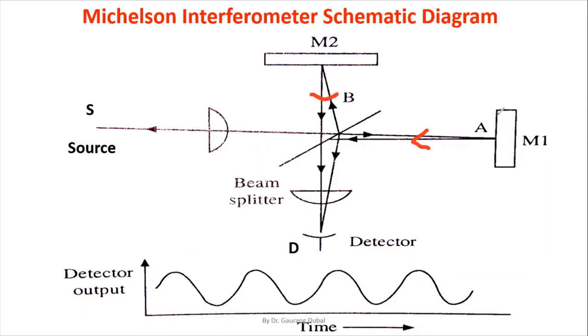यानी कि जो beam है वो mirror से reflect होके आने वाली है. So if one mirror is fixed, it will definitely get reflection. The other is moving, and there will also be reflection, but the path length will be changed, and due to that the beam's frequency will be changed a little bit. Uski jo wavelength hai usme thoda variation aayega, aur wo variation ke karan wo thodi different wavelength wali ho jayegi. So after that both come to this point and get combined. जो दोनों फ्रीक्वेंसीज वेवलेंथ आएगी वो इधर आके सेंटर पॉइंट पे कंबाइन होगी, then it will pass through the sample and then go to the detector.